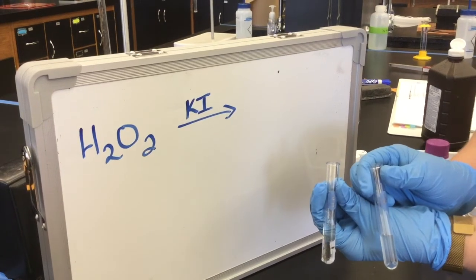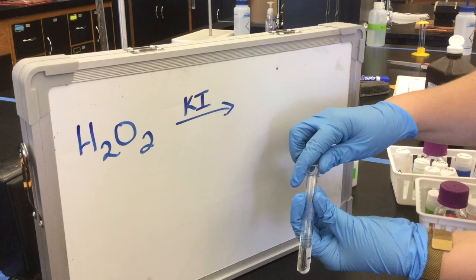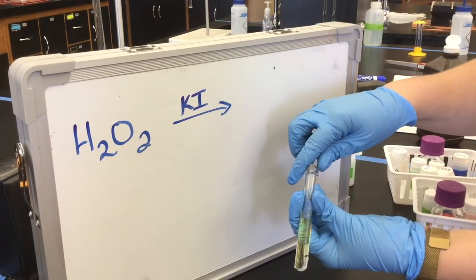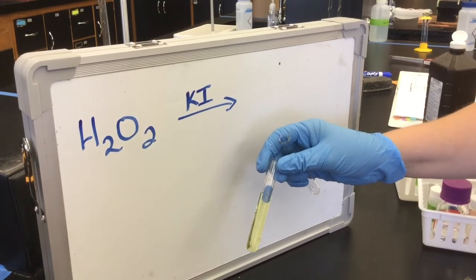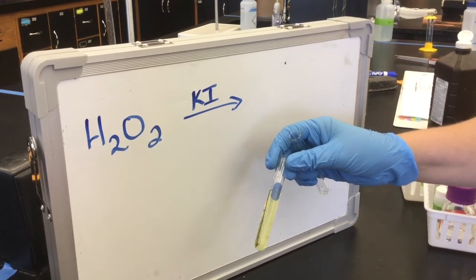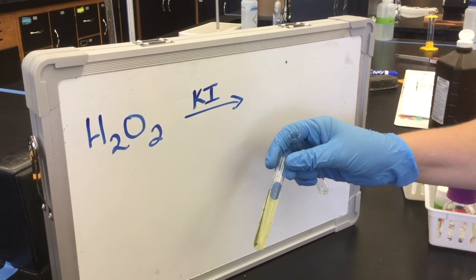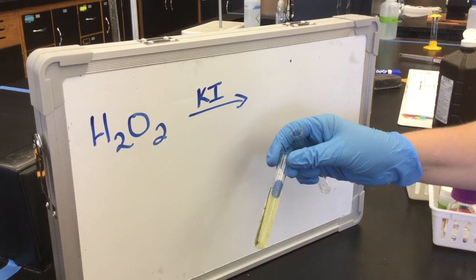Any amount should give some reaction. An increased amount should make the reaction go faster. You'll notice a change in color right away, but the real reaction that you're looking for will be very subtle and will take some time to get started. So hold on to this one a second and examine it closely before you move on to the rest of your lab.